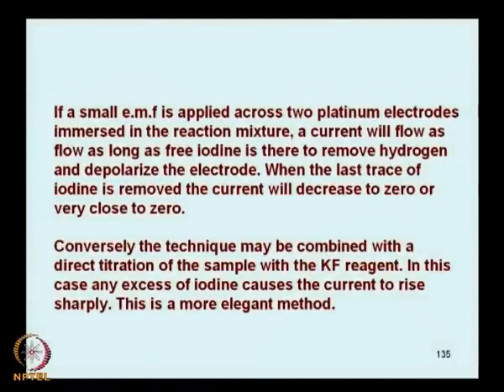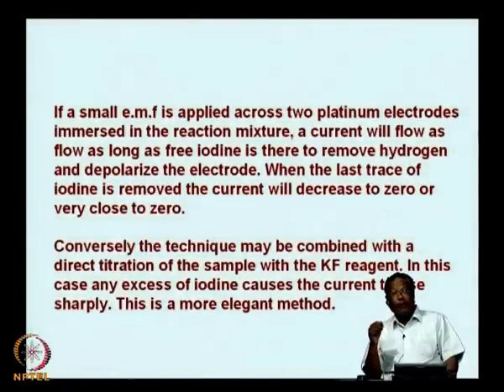So, the end point is easily determined. Even otherwise, the end point can be determined electrometrically. That means when the reaction is complete, you will not see any current. If a small EMF is applied across two platinum electrodes immersed in the reaction mixture, a current will flow as long as free iodine is there to remove the hydrogen and depolarize the electrode.